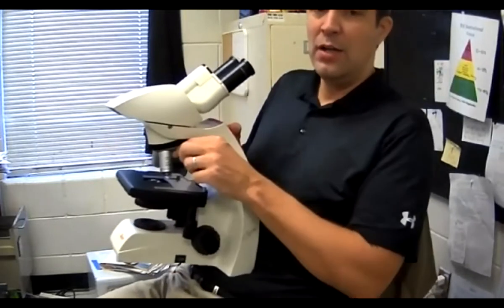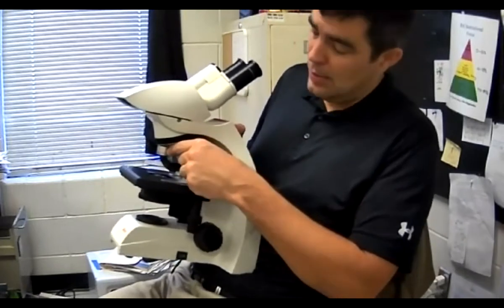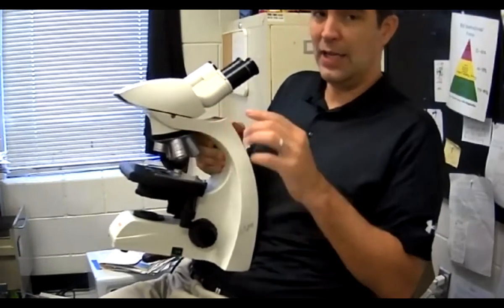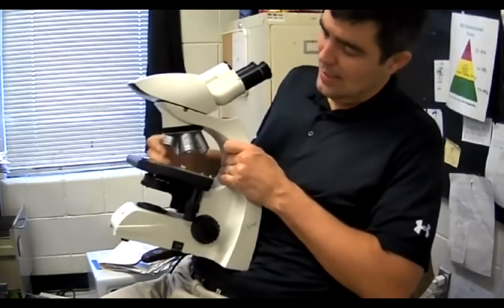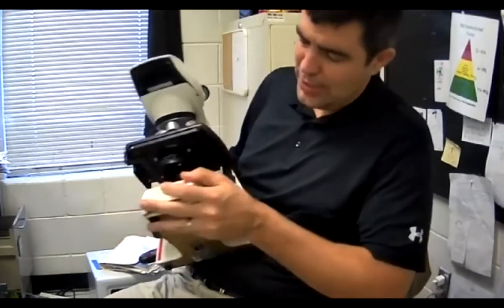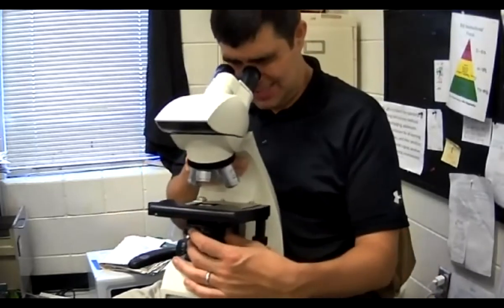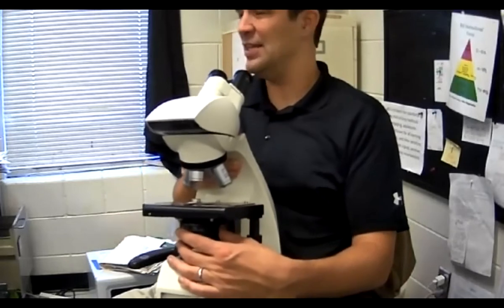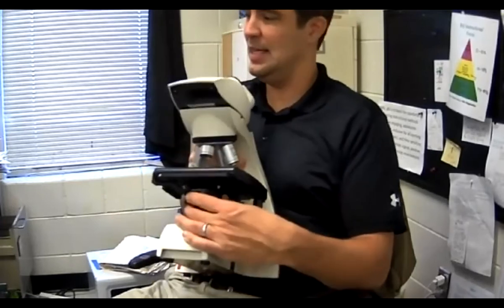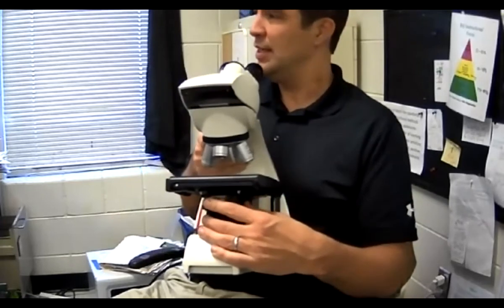Then you're going to put it on the low power objective, which is the red one, and it clicks into place — you'll hear it click. Then you're going to put it on the brightest setting on the light so that you can see, but it doesn't hurt your eyes. Adjust the diaphragm to allow the most amount of light without hurting your eyes.